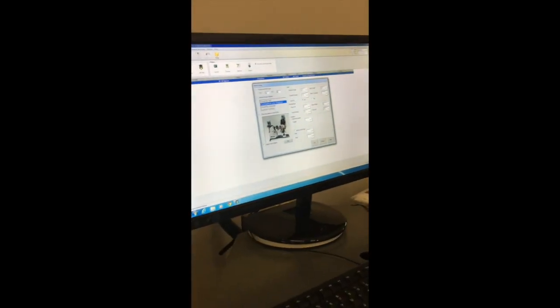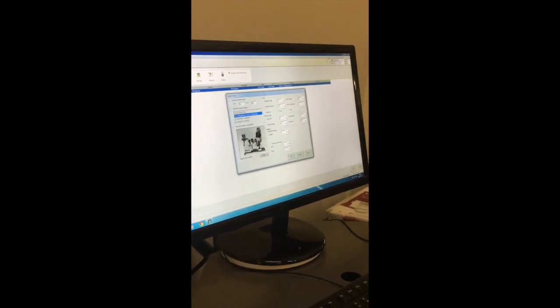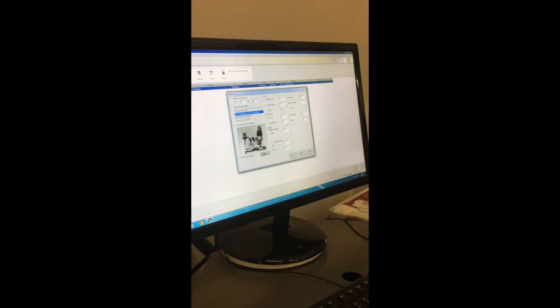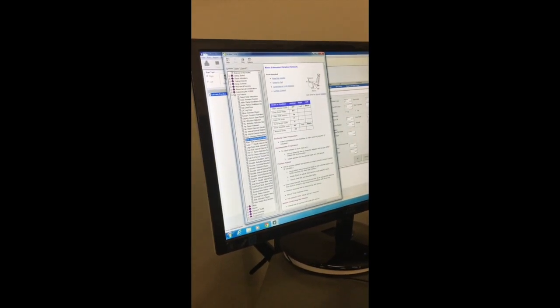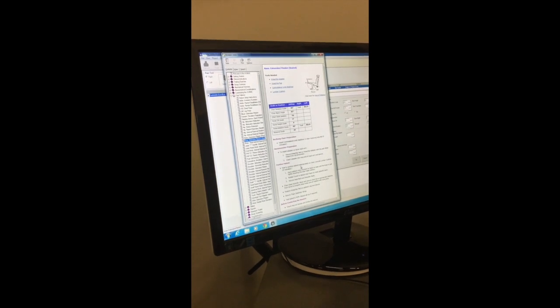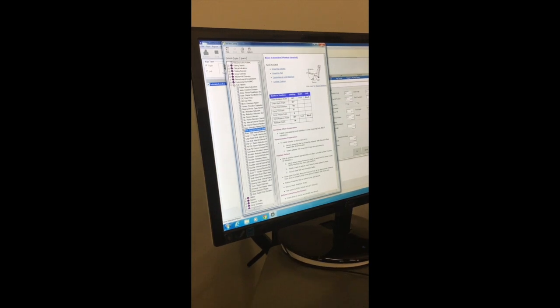Once you've got all your adapters, you can see the picture of the setup. It's not very clear. And if you preferred words, just click on help and it'll bring up how to prepare it. Again, it'll all become clear once you start doing it and once we've gone through an individual session with you. Okay, but it's all on there.